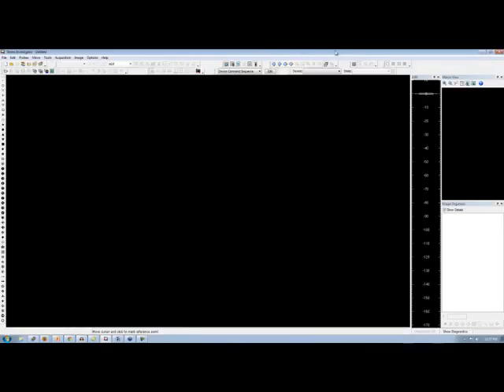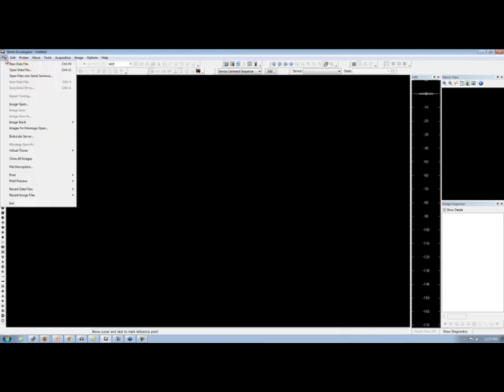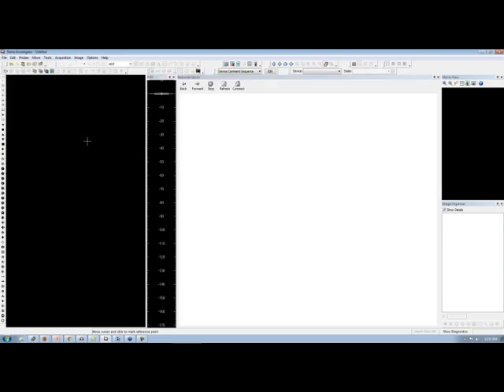All right. So I already have a running instance here of Stereo Investigator. As we had mentioned, this is the same regardless of which MBF software you're using. If you're using Neurolucida or Stereo Investigator, you're going to see exactly the same thing here. So I'm just going to go down to File. We have an option in here under File called Biolucida Server. I'm going to choose that.